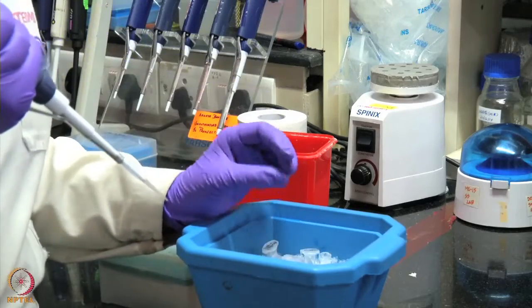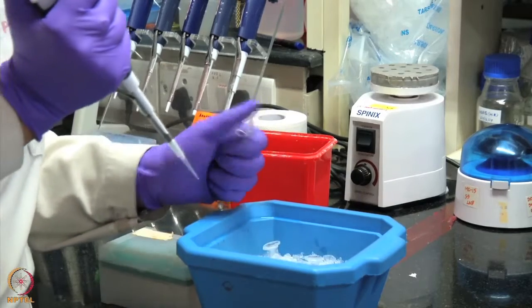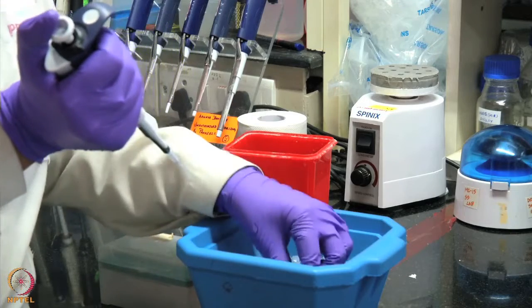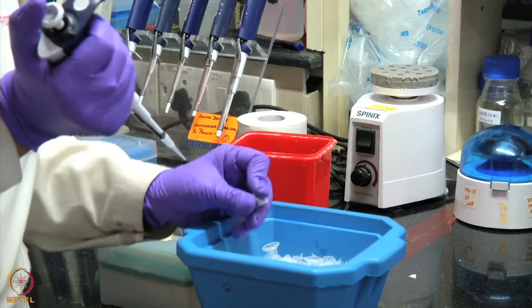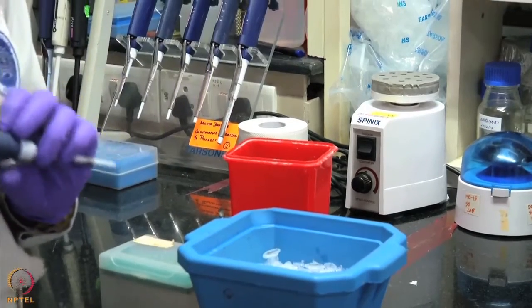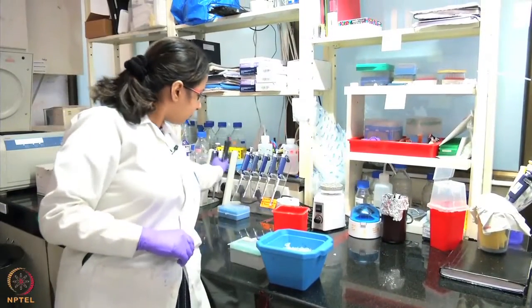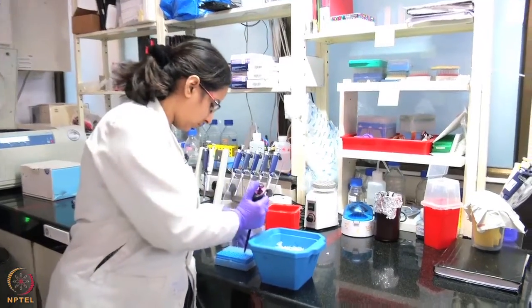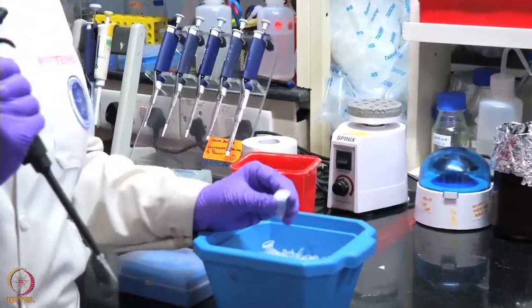We also add water to make up the volume. And the last step, we add the enzyme. Enzyme is usually added in a very small quantity, so I'll use a different pipette for that. In this case, we are using EcoRI enzyme.